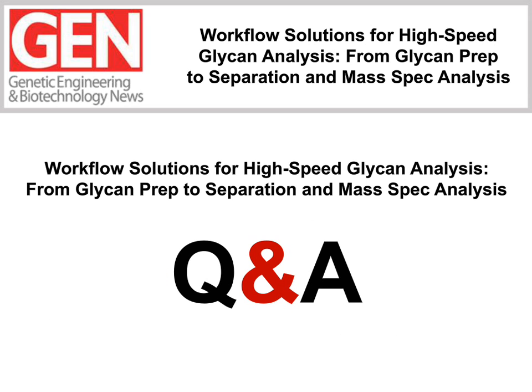Okay, and Oscar, we have another one here. According to your experience between CE and LC, which technique is more appropriate for glycan analysis characterization in terms of selectivity, MS coupling? Right, so with CE, there's two main ways that that's done. One is CE with laser-induced fluorescence detection without coupling to mass spec, and that is a very high resolution approach with sort of orthogonal selectivity compared to HILIC.